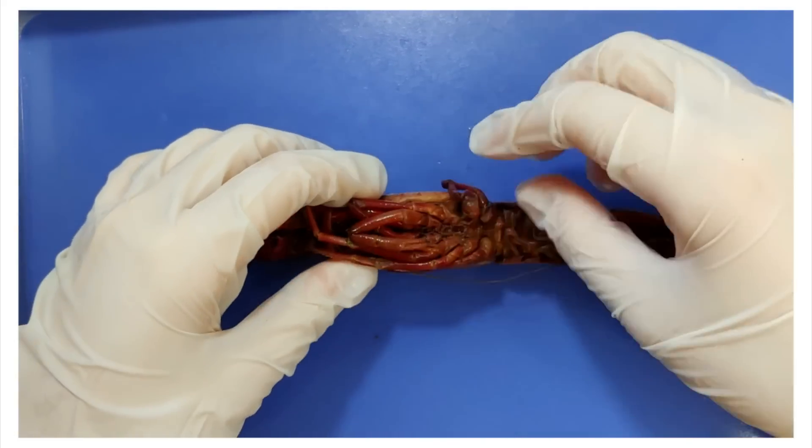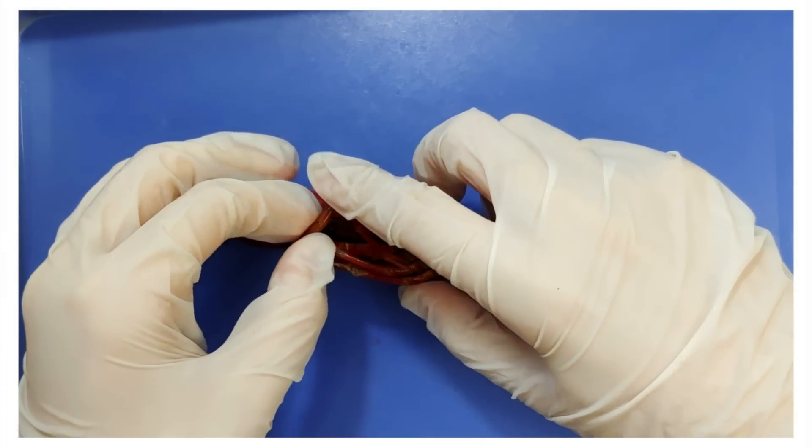So as you can see in the crayfish, its legs are jointed and it can bend back and forth like this.